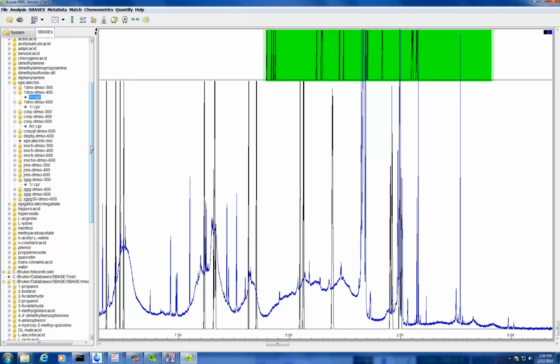Let me see. I have data. I'll show you some data where I ran blueberry or ginseng, which is obviously not exactly the same, but I'll show you what can be done. Yeah, blueberries have PACs, so if they're present in the extract, it's highly concentrated. I would imagine the extract baseline has some noise to it like that.